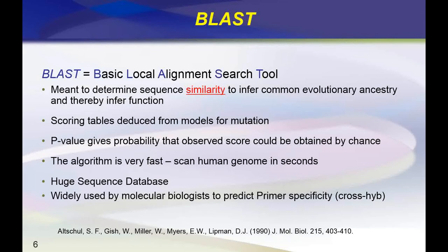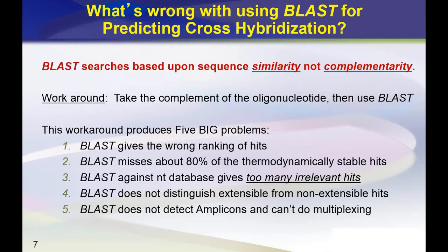And it's widely used by molecular biologists to predict primer specificity. And it's this last point that we want to talk about a little bit. All right, so what's wrong with using BLAST for predicting cross-hybridization?